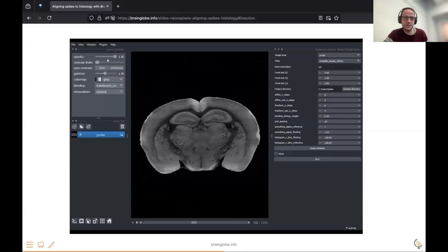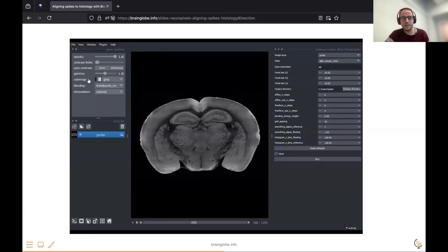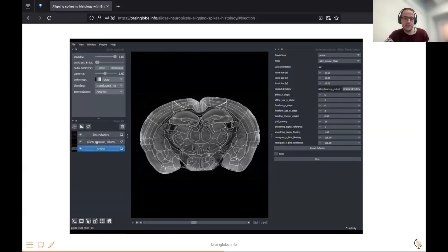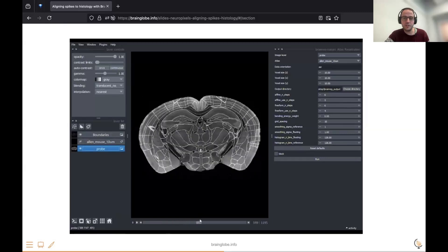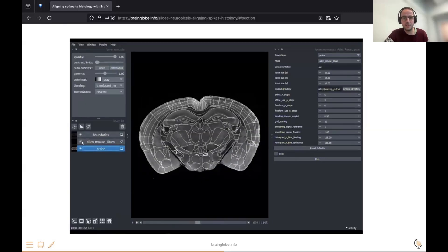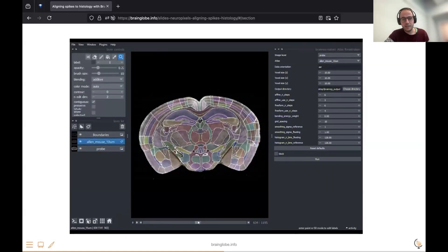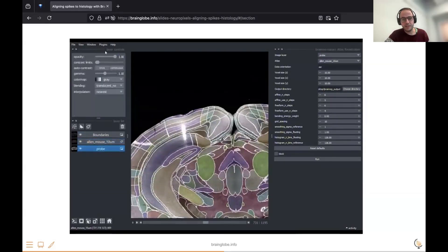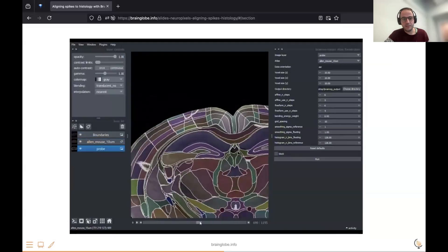Annoyingly, the video doesn't show all the menus that pop up, but our first tool is called BrainReg. You can set the orientation of your sample, as well as which atlas you want to align it to. You can then hit run — this usually takes a few hours, but magically here it takes less than a second. This allows you to show the anatomical regions overlaid onto your sample, and you can scroll through and see that the probe is, as expected, in visual cortex and then goes down towards the hippocampus.